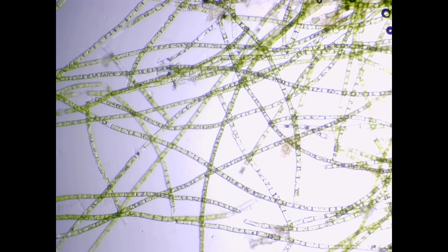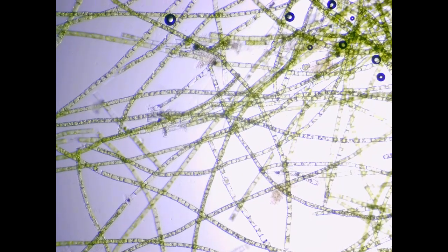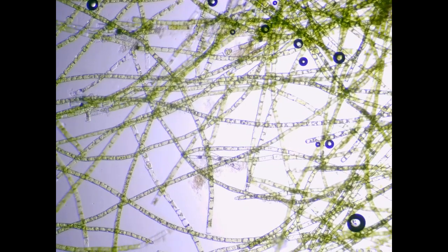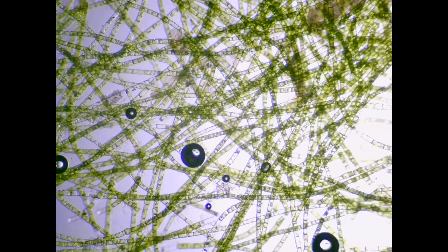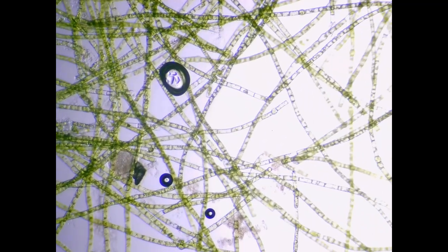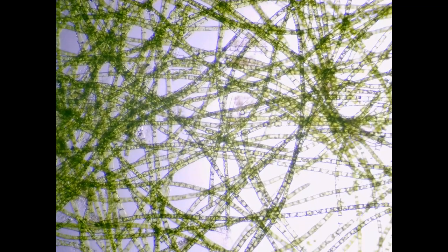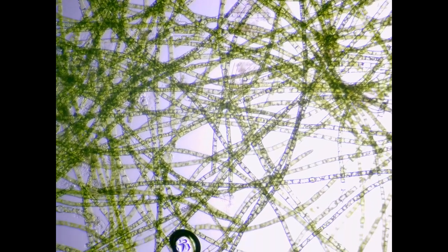Oedogonium is a genus of filamentous green algae belonging to the class Chlorophyceae, commonly found in freshwater environments. It forms unbranched thread-like filaments that are attached to substrates or may be free floating. Each filament is made up of cylindrical cells joined end to end.